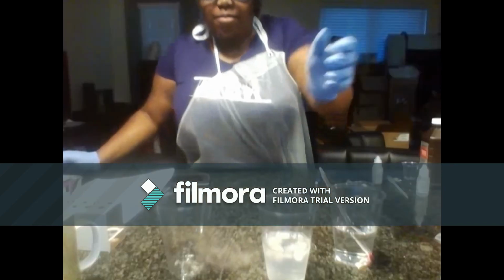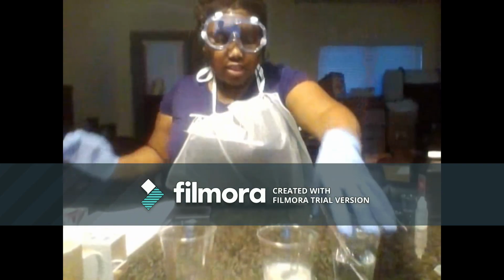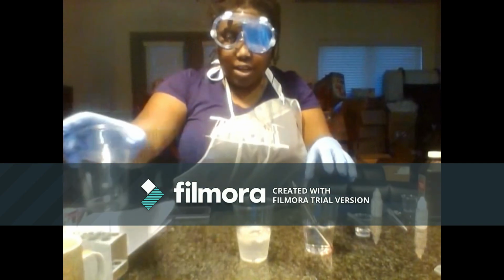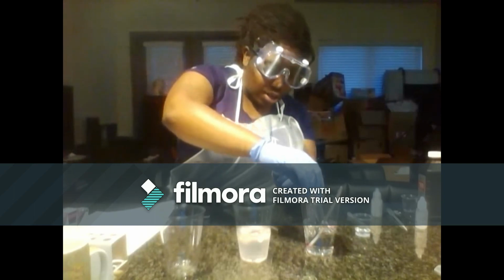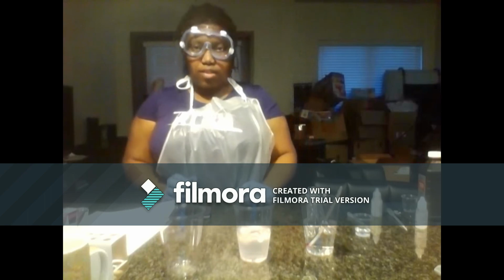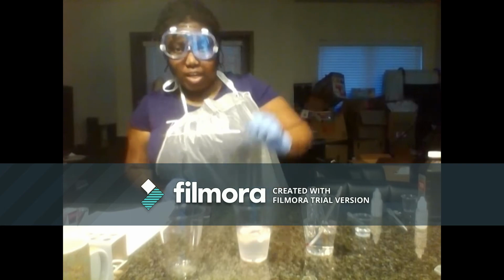Right, so I've prepared my water baths for this experiment, a little bit closer to me so you can see them. And my hot water bath I'm just going to leave over. And this is my reactant tube, and then this tube is my hydrogen peroxide. So I'm going to let them sit for 5 minutes so that they become the correct temperature, and then I will come back and start my reaction and start my timer.